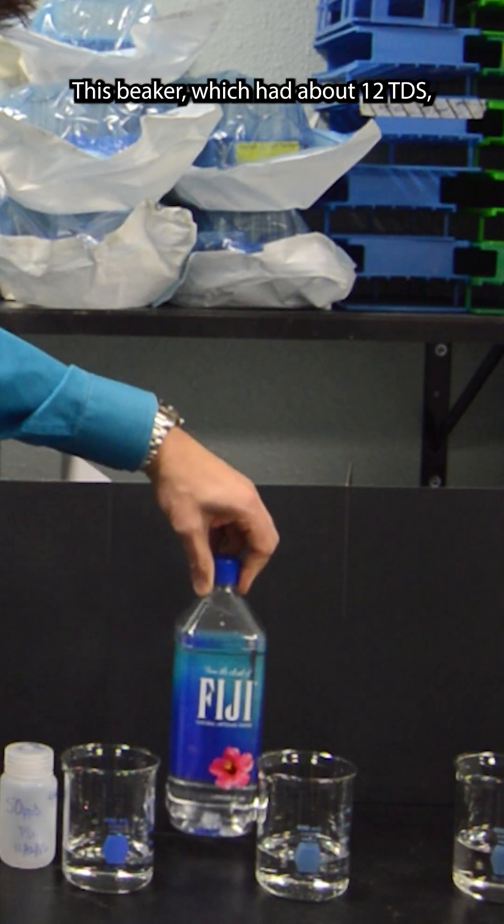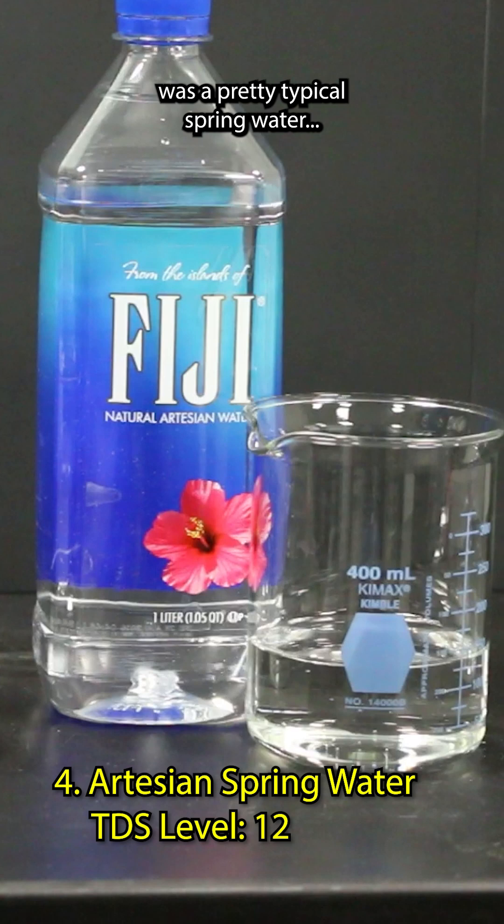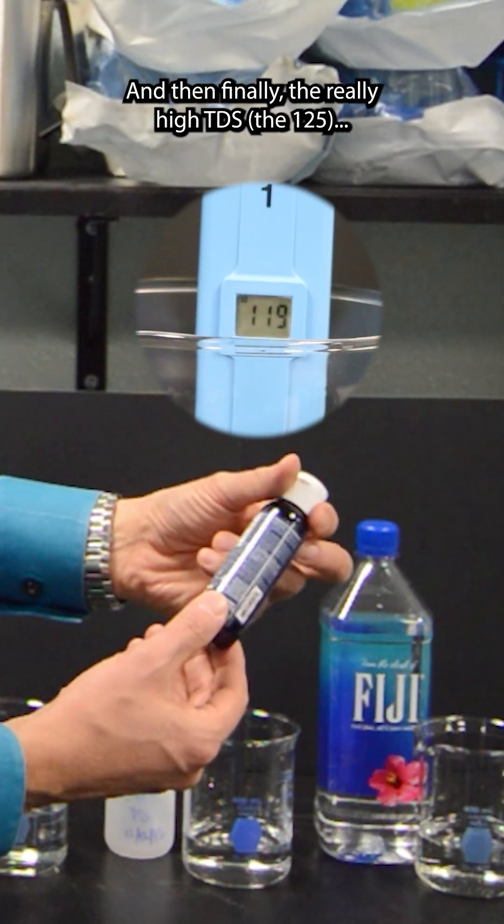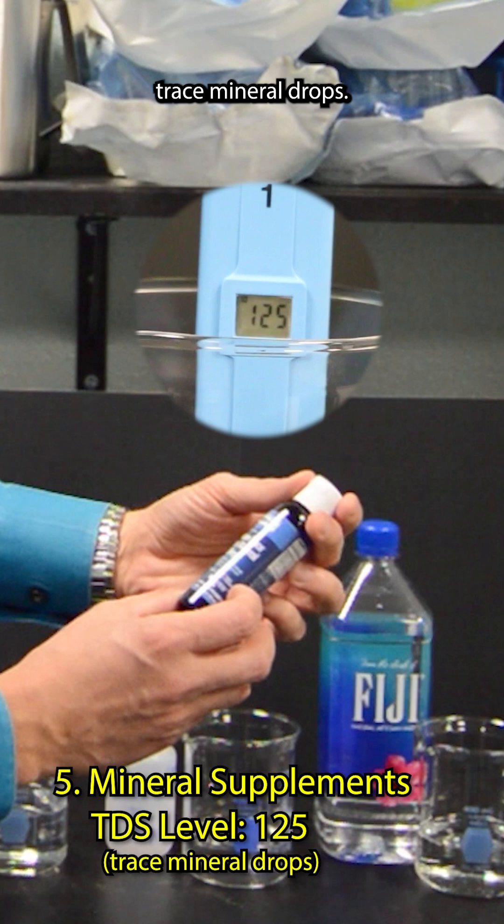This beaker, which had about 12 TDS, was a pretty typical spring water, artesian water. Finally, the really high TDS, the 125 trace mineral drops.